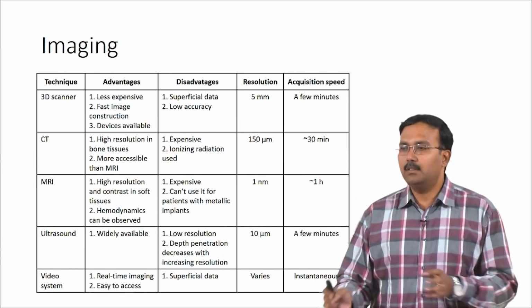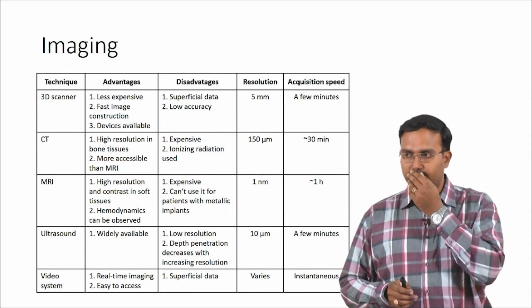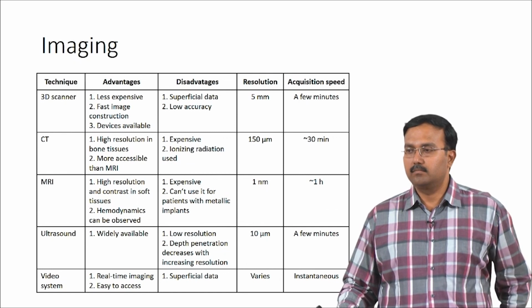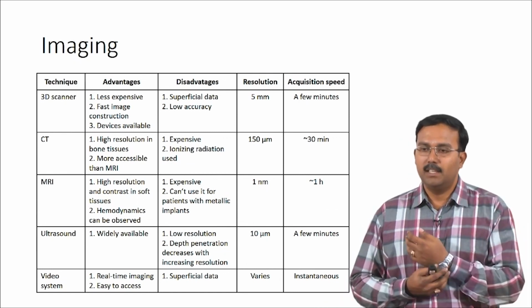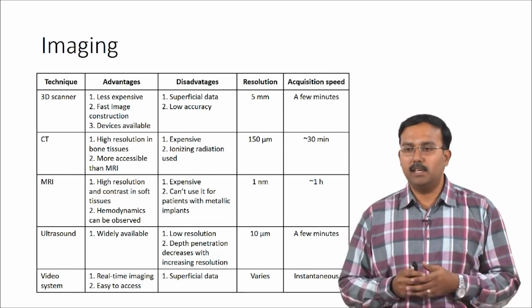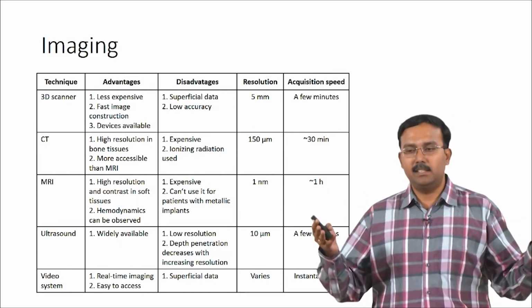Yeah. So there are these types of scanners, and there are also scanners where you put an object inside, and it will scan accordingly from static. It's like a regular scanner which scans a surface, but here it does it for a 3D structure. So you can have it in any size and shape.